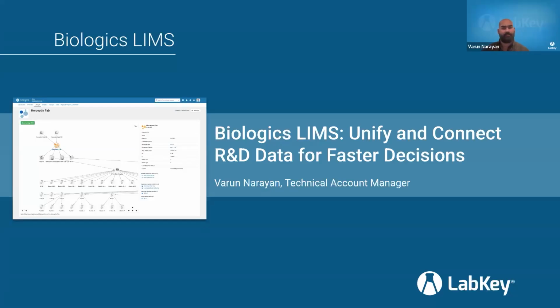So we're going to spend a little bit of time talking about the problems that people are facing in the scientific community. We'll highlight some of the features of Biologics LIMS. But for the main bulk of this webinar, we're actually going to be jumping into the product itself and showing you how it works and what's possible within the product.